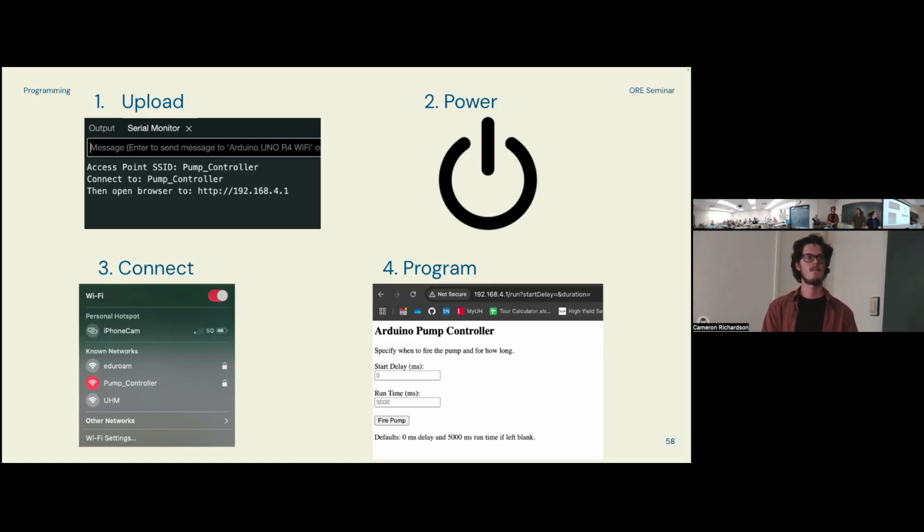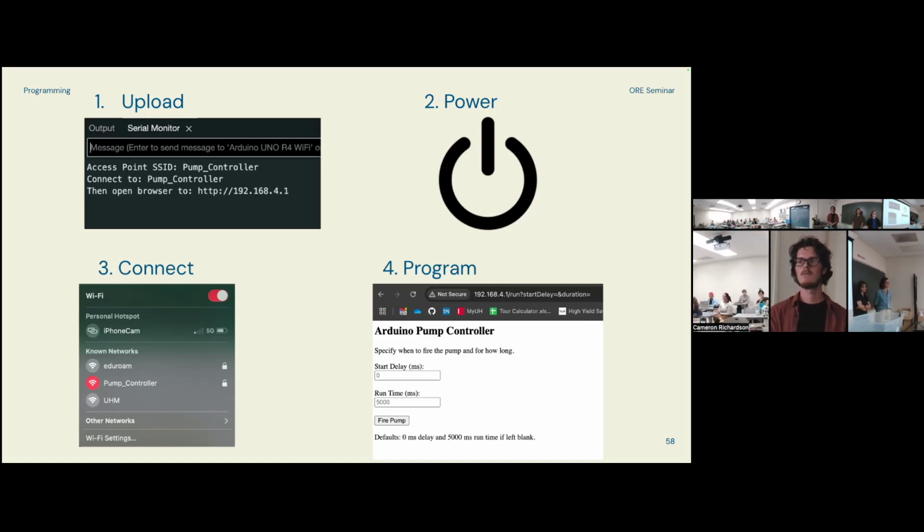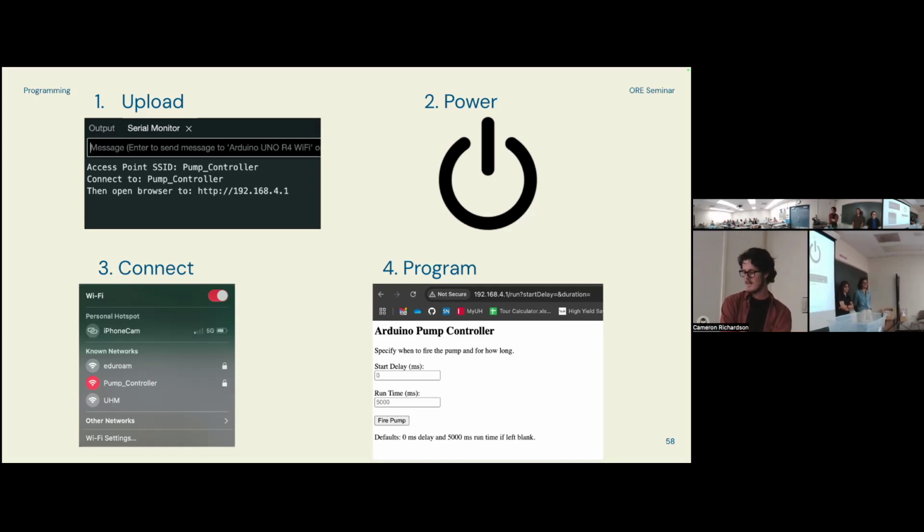The way this is set up, if you deploy it, you would set up the delay, or the starting time, before you even put it in the water and hit run. If it's supposed to sample at 1 o'clock, you can deploy it at 12, set that before you deploy it, and it will automatically do that once it's underwater. So there's no need for connection while it's in the water. So I guess you just have to remember where you put it. Yeah, that would be ideal.